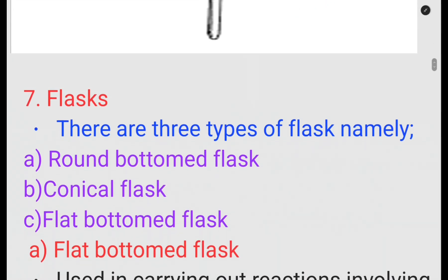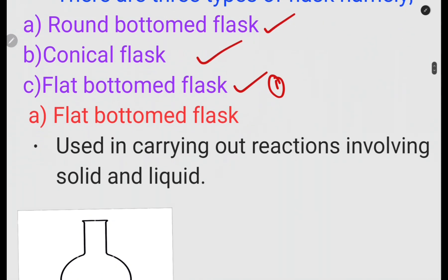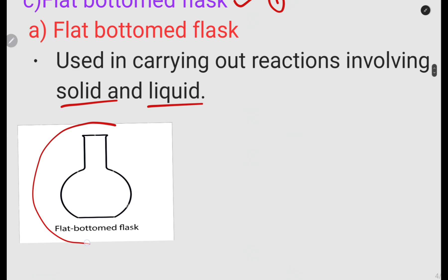Next we have flasks, and there are three types we are going to look at: the round bottom flask, the conical flask, and the flat bottom flask. Starting with the flat bottom flask — it is used in carrying out reactions involving solids and liquids. It is simply flat at the bottom, which is why it is called the flat bottom flask.